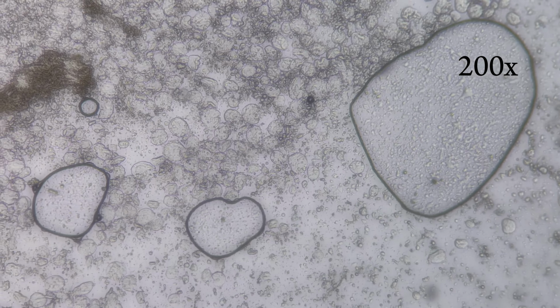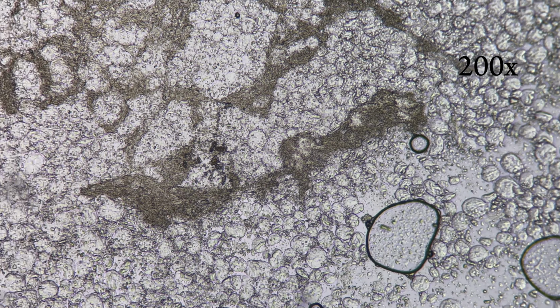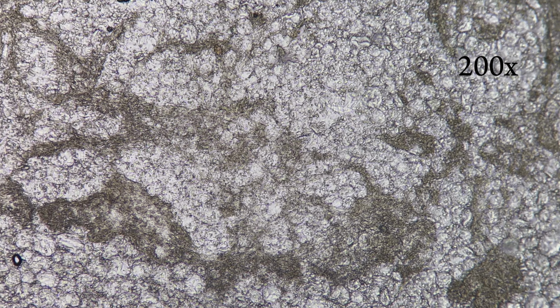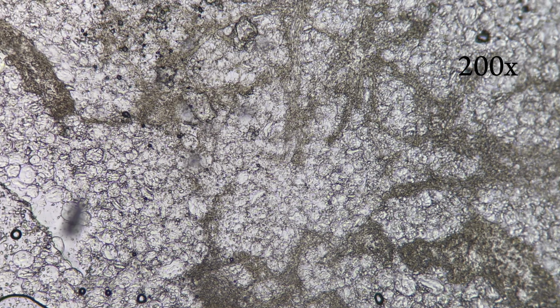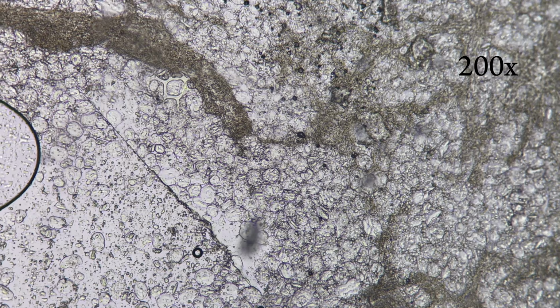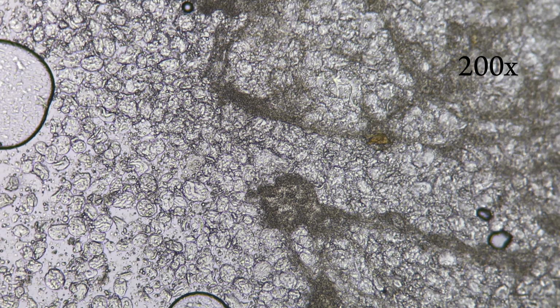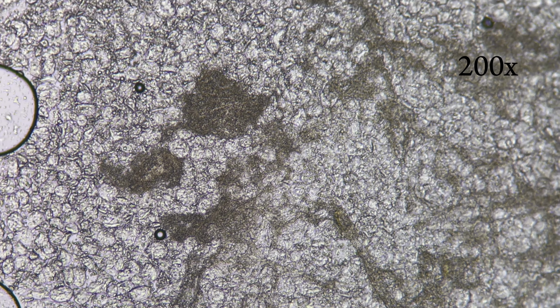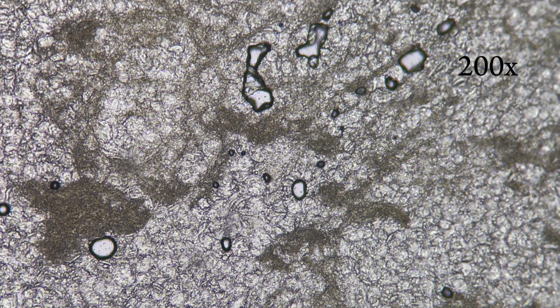At 200 times magnification, the internal structure becomes more organized and easier to interpret. The air-filled cavities are now clearly defined with visible boundaries separating them from the surrounding material. The walls between these spaces appear thin and stretched, showing how the dough expanded as gases formed inside it. These walls are uneven in thickness, indicating that the expansion did not happen uniformly.